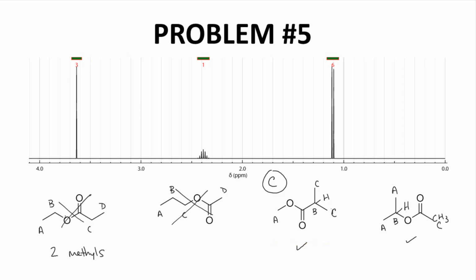So let's look at this a little more closely. How about for problem C, where would this peak show up? Now I just said this hydrogen, it's on a carbon and it's next to another carbon. Not very fancy, not very de-shielding, and notice that signal shows up around 2.5 or so. If our spectrum matched our rightmost structure, then this CH is right next to an oxygen.